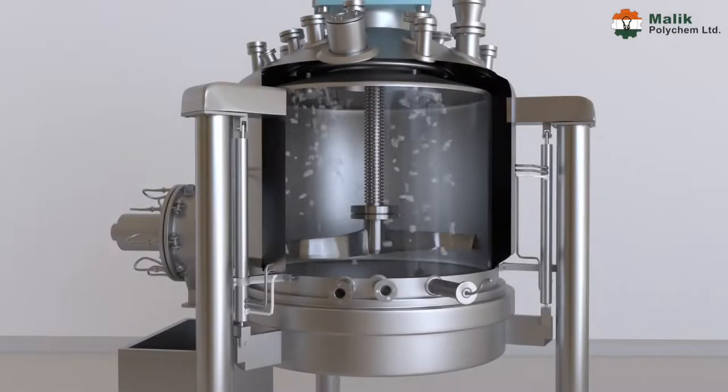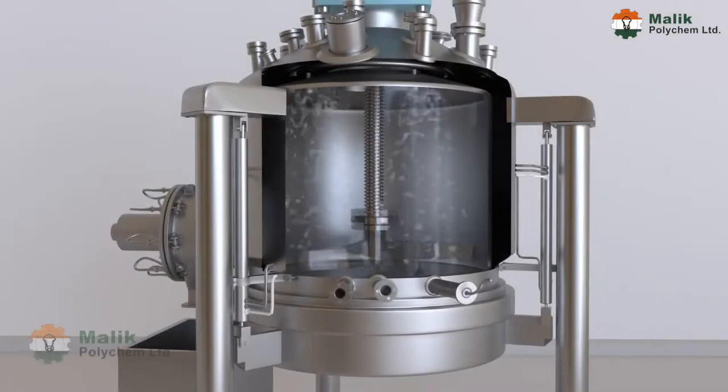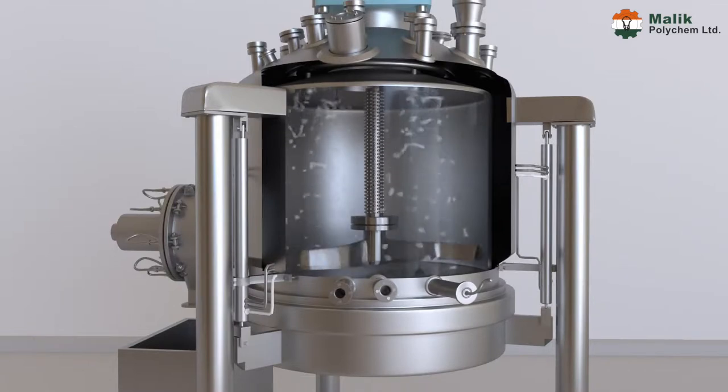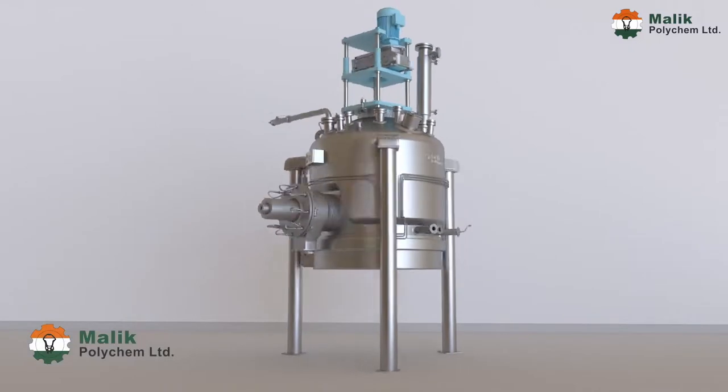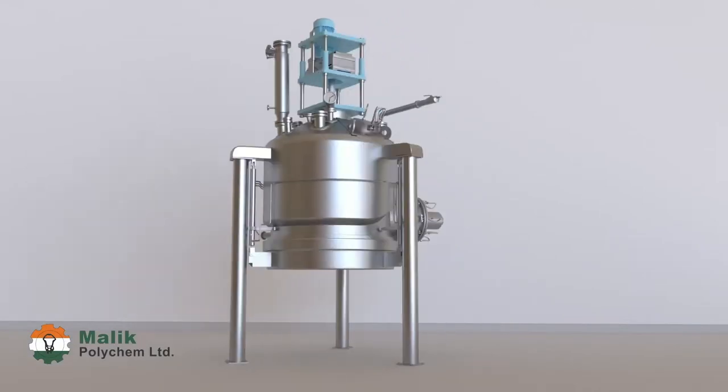Thereafter, washing of the vessel is done, which makes it free from any contamination of the previous batch and ready for the next batch. This is what we do at Malik Polychem Limited.